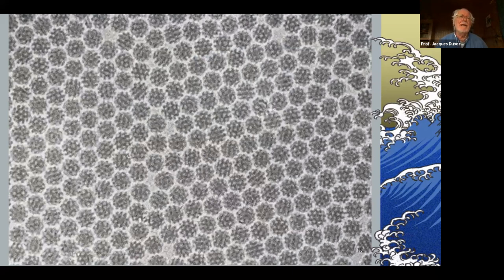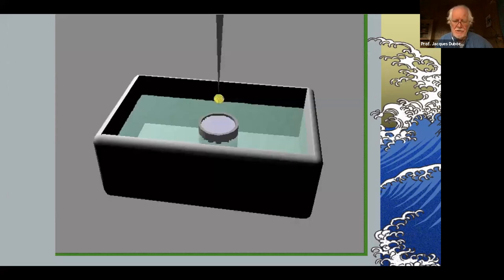This is a pure film of vitreous water, nothing else than virus in vitreous solution. The ideal specimen indeed. It's quite simple. You put the drop on the grid, you come with a blotting paper, you press the blotting paper on the grid. It takes about 1 second so that almost all the liquid goes into the blotting paper, not quite all, the last tenth of a micron, but that's another story.